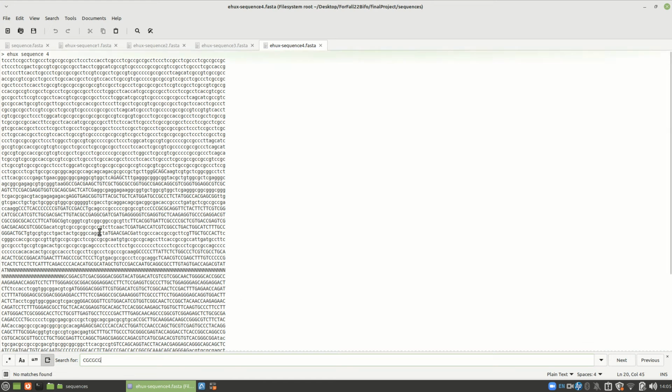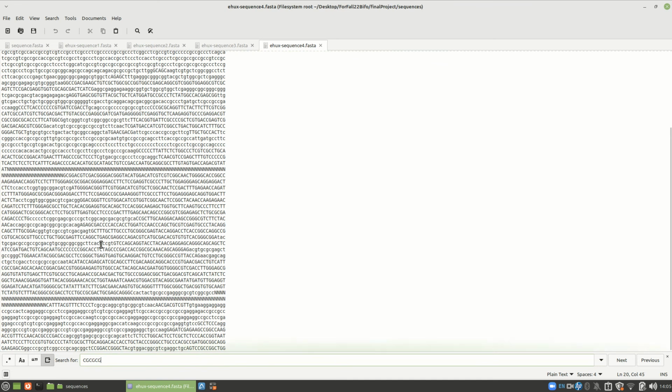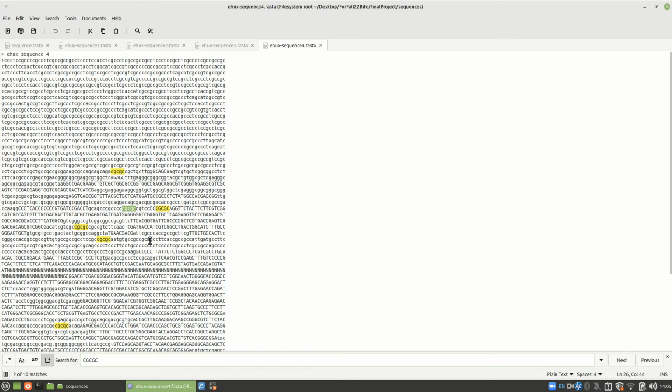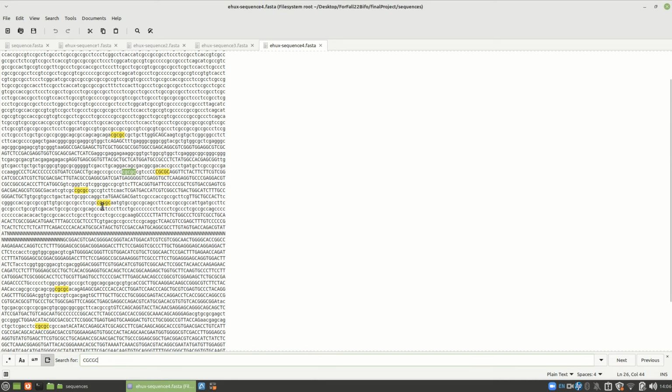Well, I've got three CGs, and I don't get anything. So this one is very low in CG content. So here we go. Lots of CGs here, a few here. I would think this is your promoter. This is a potential promoter down here maybe. This probably is not enough, but you never know. I see CGs all around. But this is your probable promoter, and this is your gene. But you shouldn't get too many CGs inside a gene.